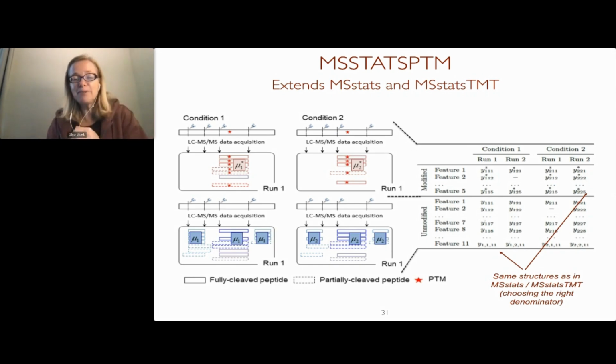So essentially for the same protein with the double data structure, these are all our features which have the modification, and we will use them to characterize changes in PTM and stoichiometry between conditions. And these are the features that do not have modifications, and we will use them to characterize the overall change in protein abundance. By the way, where do these features come from?